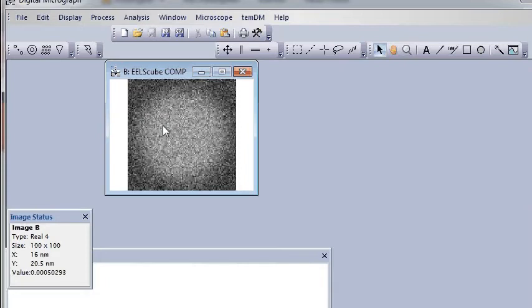So what is that? PCA is also some kind of rotation, when you express your data not in the original energy channels but in principal components, which are the new linear combinations of the old channels. Now we will continue to rotate in such an abstract space, but there is one important difference.